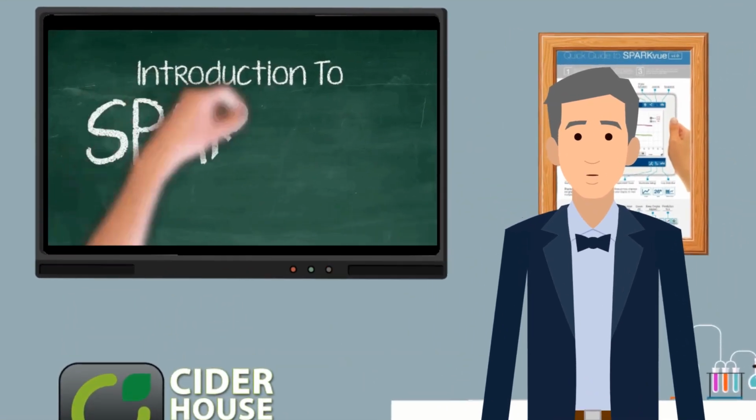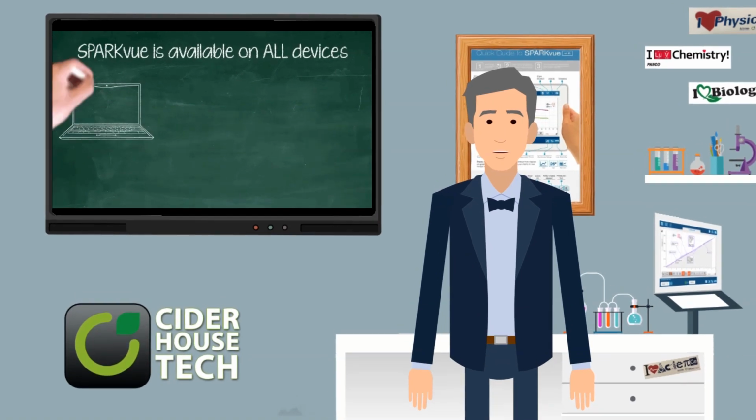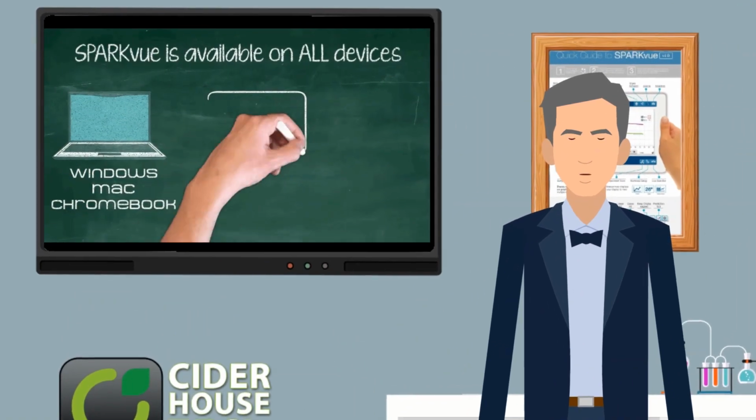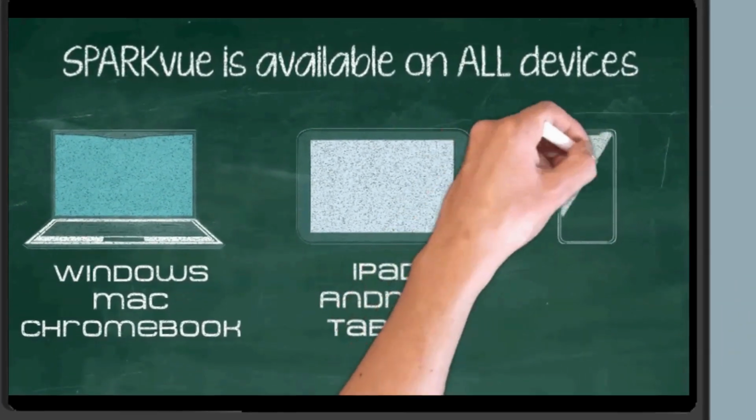Introduction to SPARKvue. SPARKvue is available on most platforms: PC, Mac, Chromebook, iPad, Android tablets, iPhone, and most Android phones.